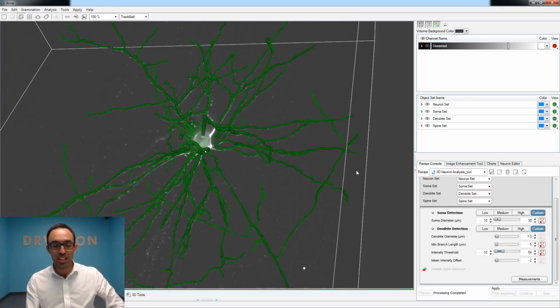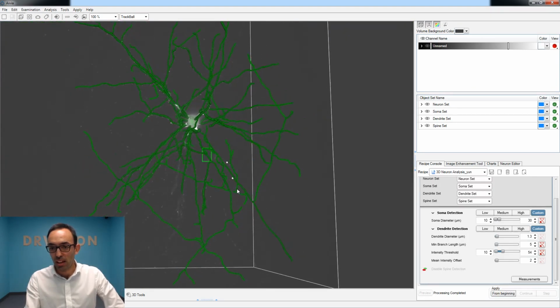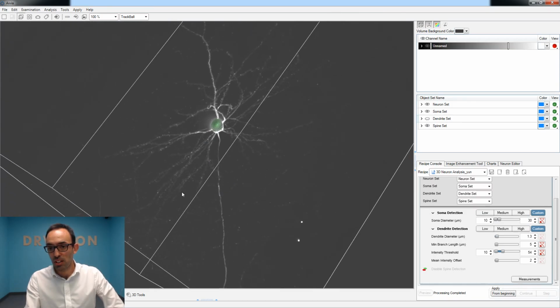Nothing? Okay, good. So the analysis has been completed, and now the rendering is happening, and it's already completed as well. So we can already start to explore the results. So let me show you. So that's the original volume rendered image.